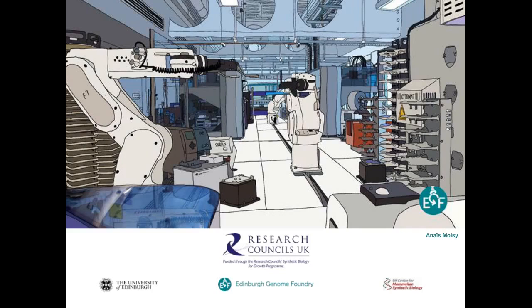Do you somehow pre-screen your colonies before picking them, or is it a random pick? Well, that's a good question, actually. The QPix instrument that we have is set up to be able to do a pre-screen because it has a fluorescence turret that allows us to image all the colonies for fluorescence beforehand. We don't currently do that, but that is definitely something that we will do in the future.